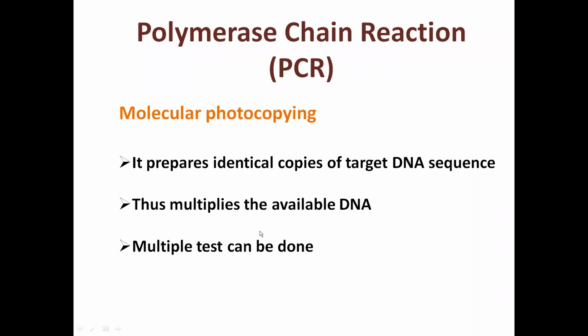In today's lecture, we are going to discuss the polymerase chain reaction, and the short form is PCR. This is also called the molecular photocopy because in this process, we can prepare identical copies of the target DNA, thus multiplying the available DNA and giving us enough sample to study or to test multiple types.